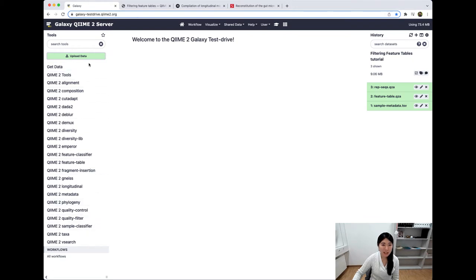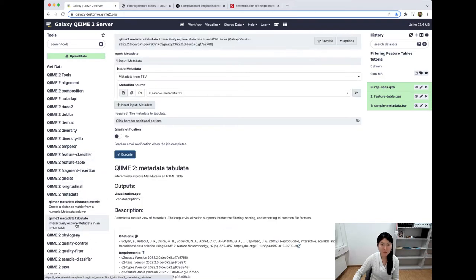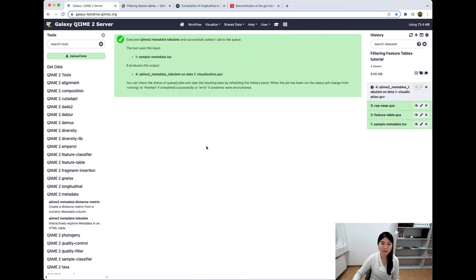Let's head back to our Galaxy server. On this left-hand side, we have a list of different QIIME 2 tools that we can run, and we want to run QIIME 2 metadata — specifically tabulate. We want this input to be a TSV file, since that's what we started off with. We want the metadata source to be exactly this sample-metadata.tsv. And we'll execute. That's going to run for a little bit.